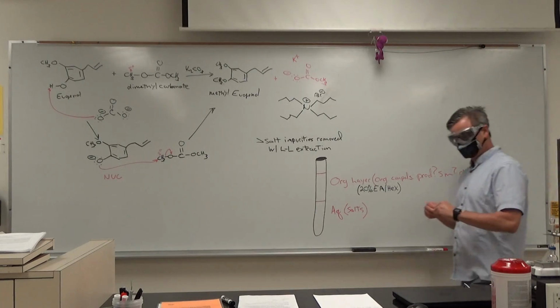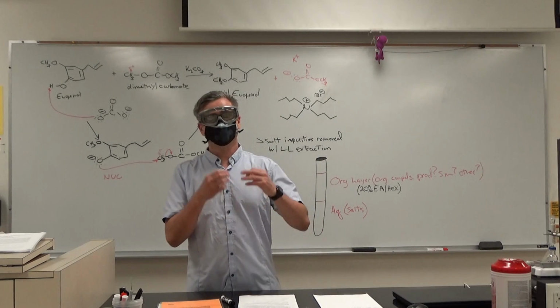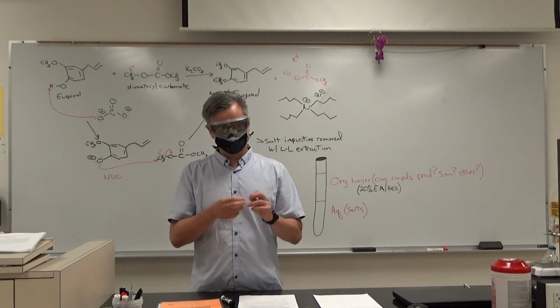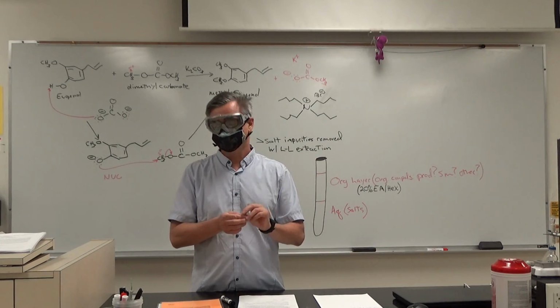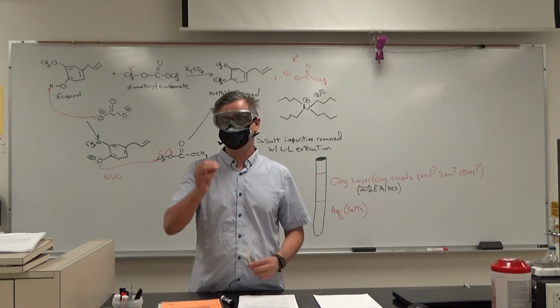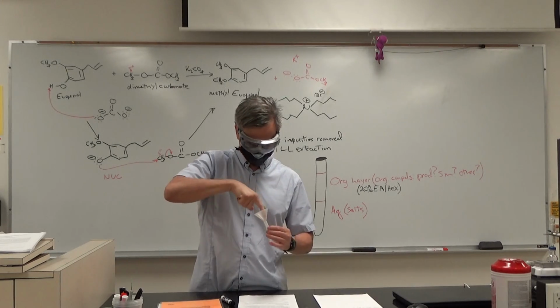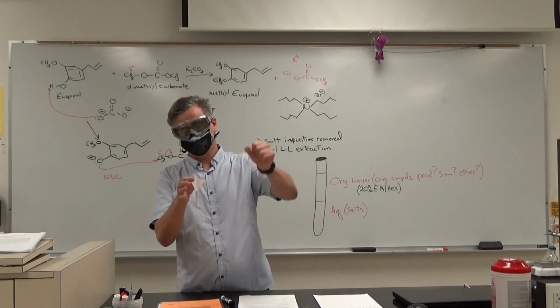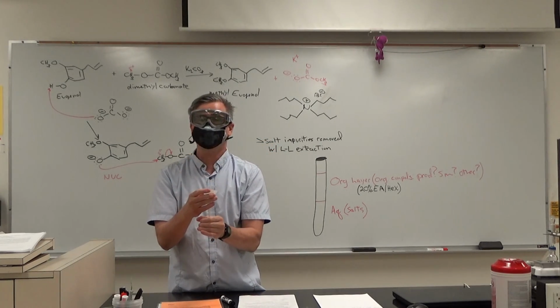Once you have free-flowing powder and you're confident that it's dry, you need to filter out the magnesium sulfate and get it separated. So what you're going to do is take, and now we're talking about a green pea of cotton. You stuff it down in there, and then you pour your stuff through there. That'll catch the magnesium sulfate. The organic will go down into your beaker.